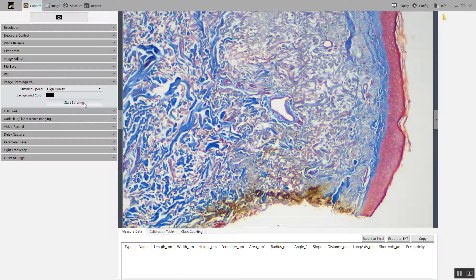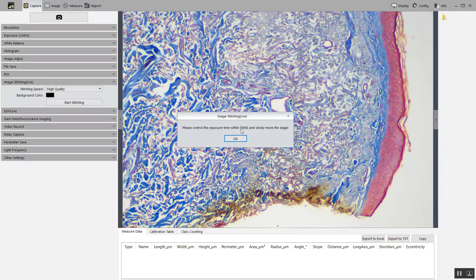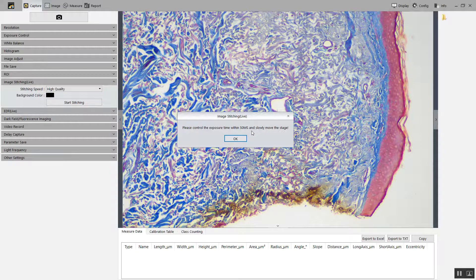Click start stitching. It wants to make sure that you are imaging at least 50 milliseconds or faster. Click OK.